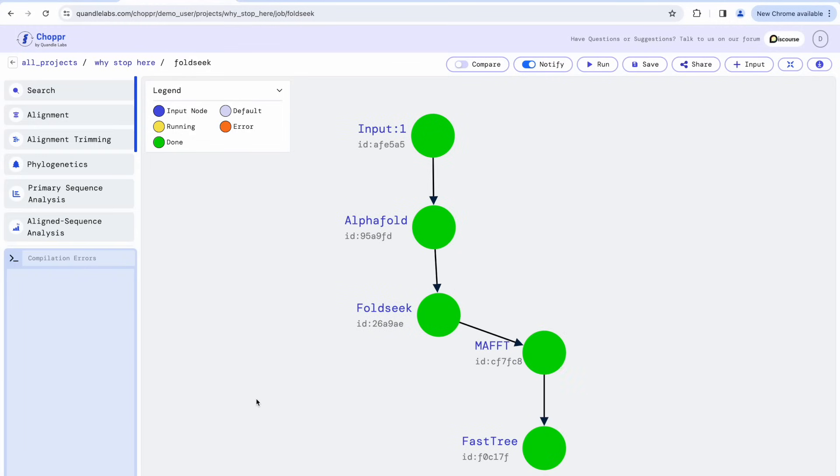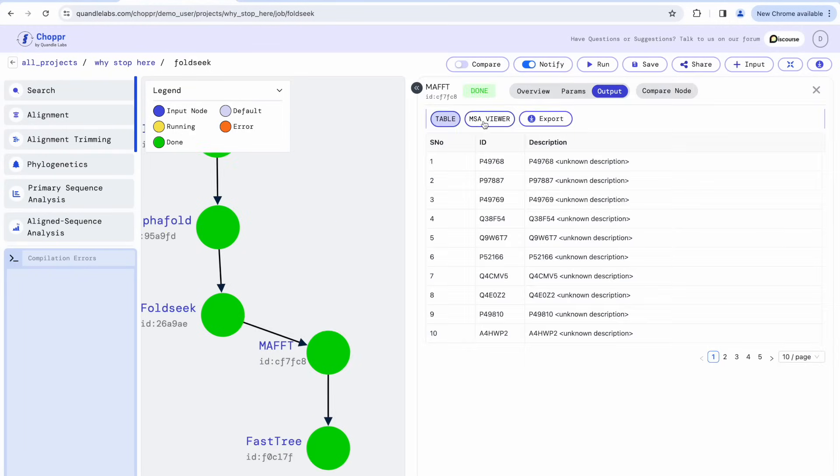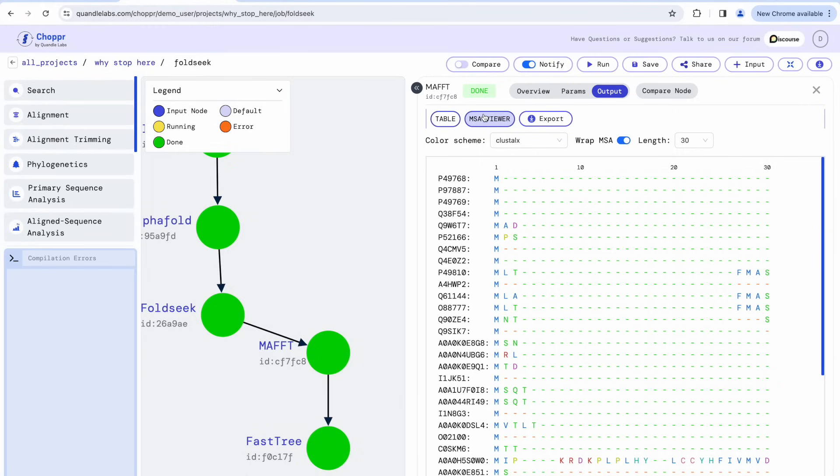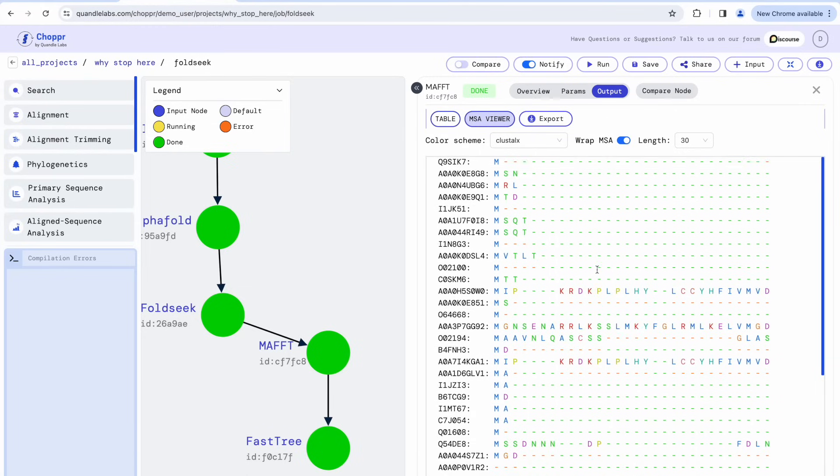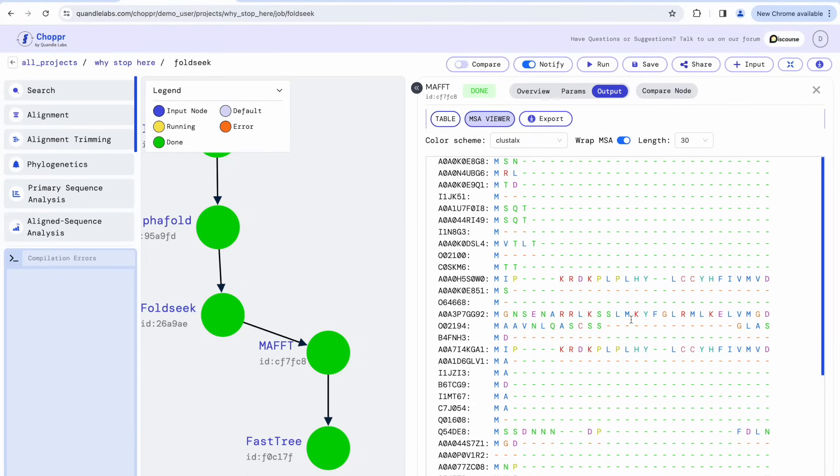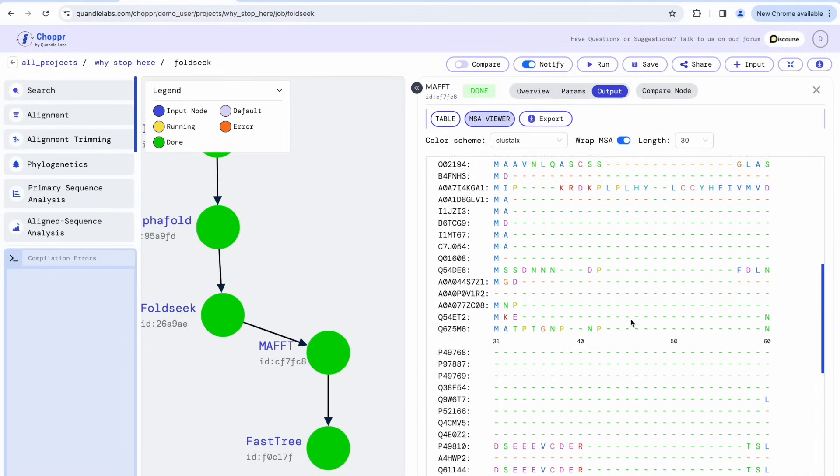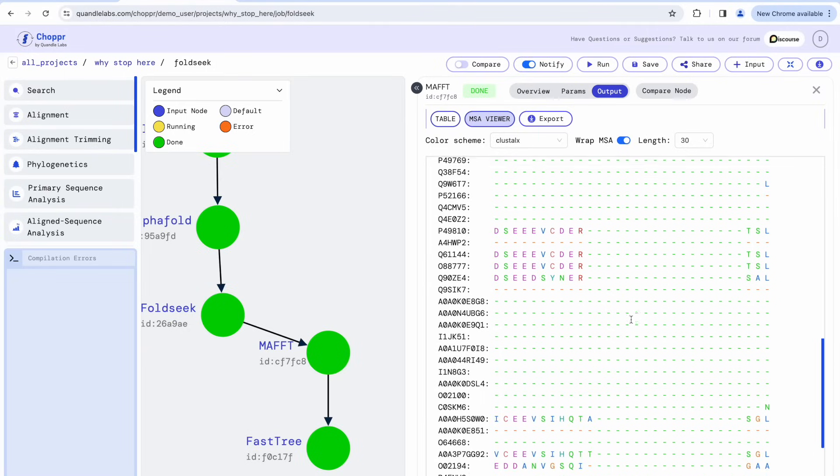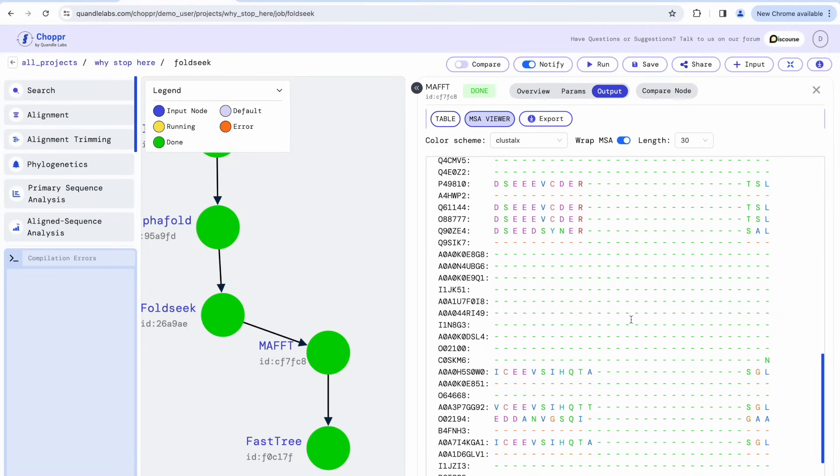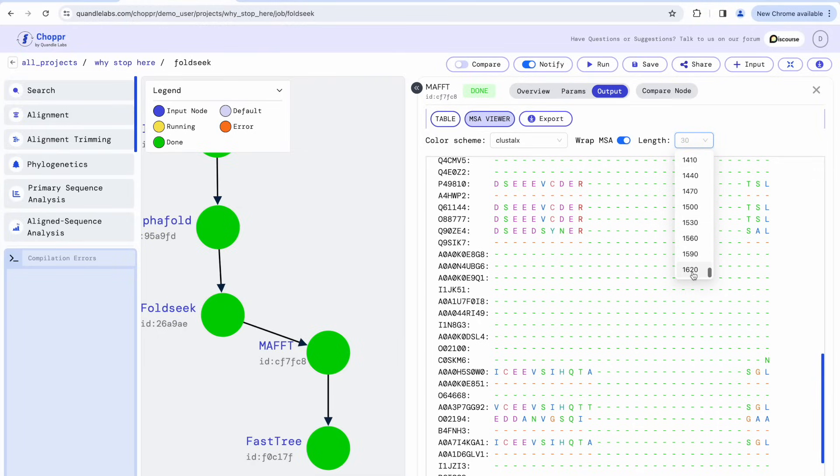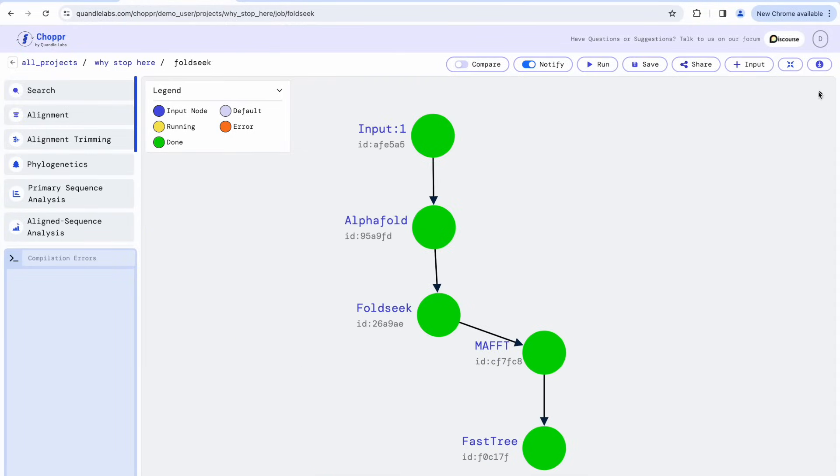Choppr has its custom inbuilt alignment viewer using which we can analyze MAFFT's results. It looks like a lot of gaps were added to align the result sequences of FoldSeek. This is not surprising as the overall sequence identity was quite low. The length of the MSA is more than three times that of the input sequence.